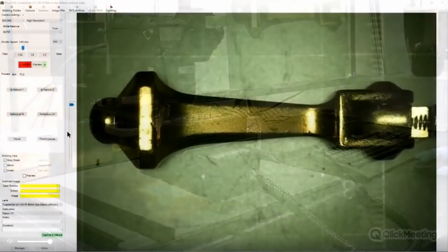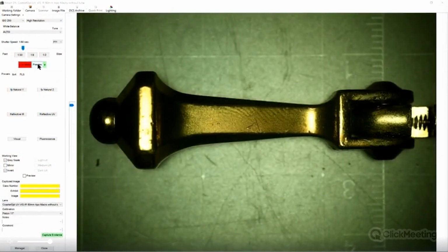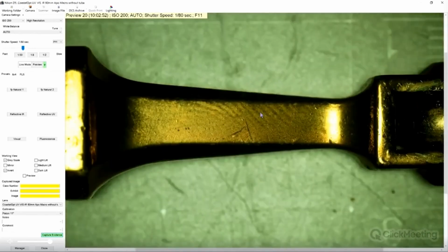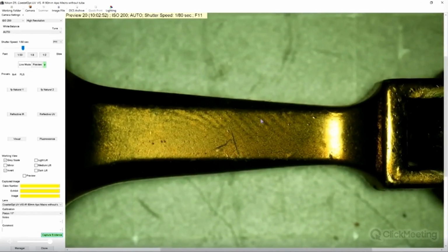finger mark. So in this example we can actually see a finger mark visible. It is only a partial finger mark, but due to the size of the object this wouldn't be unexpected. We can zoom in and we can see clear ridge detail along the middle of the sample.